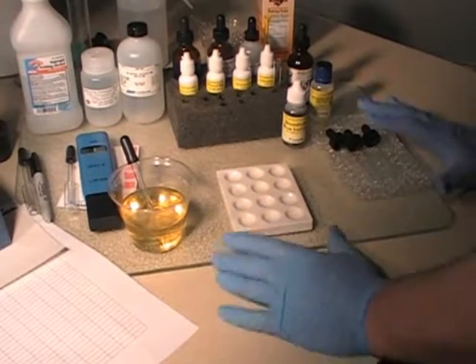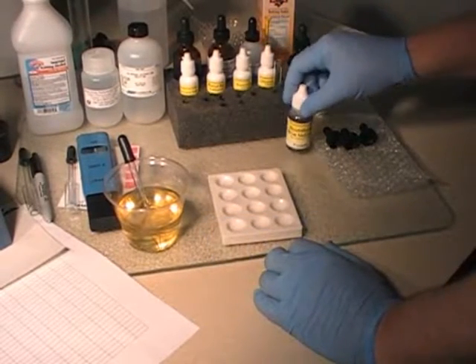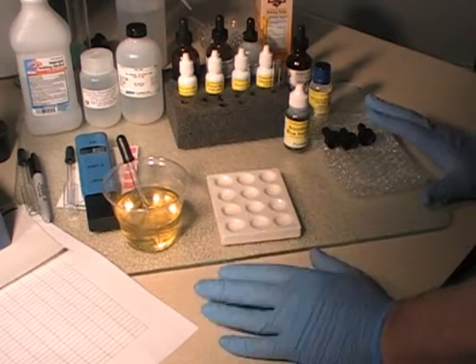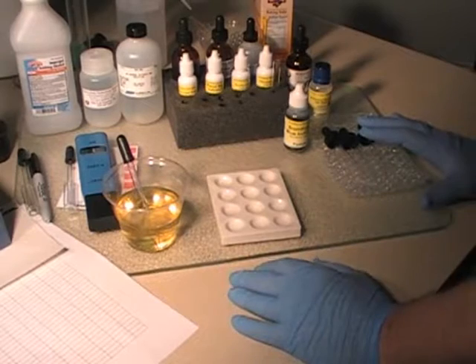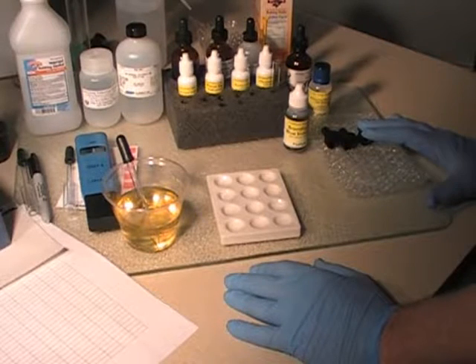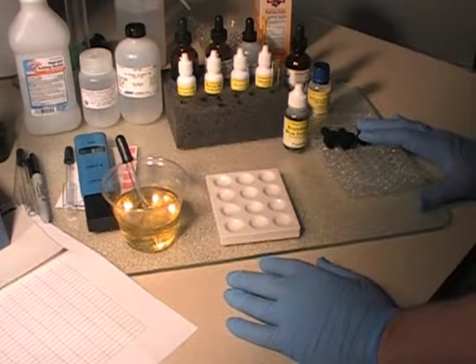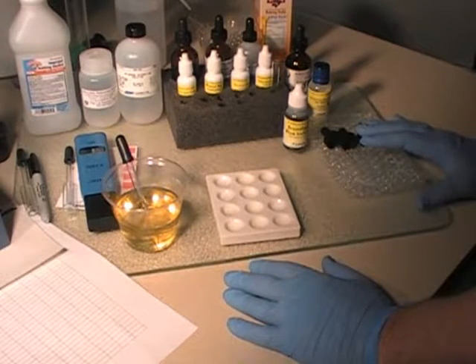The first reagent we're going to use, and just let me say a word about the reagents. The reason we use the reagents instead of a pH meter or tape is this: the reagents are the steadiest, the most reliable way of testing the pH. I have never found a better way. We've used pH meters in the past, and we have found them to be very, very touchy. Sometimes, if they're not properly calibrated, they will give you false readings, and even when they seem to be properly calibrated, sometimes they seem to give false readings as well. The pH paper is also problematic. It doesn't give as clear a reading as the reagents. The reagents are the gold standard, and that's why we use them.